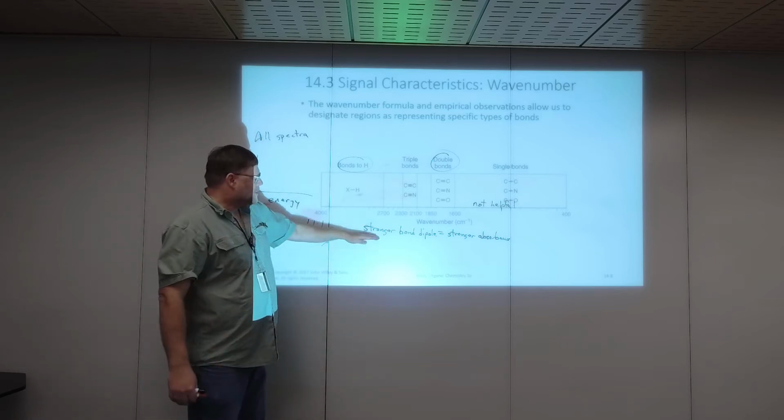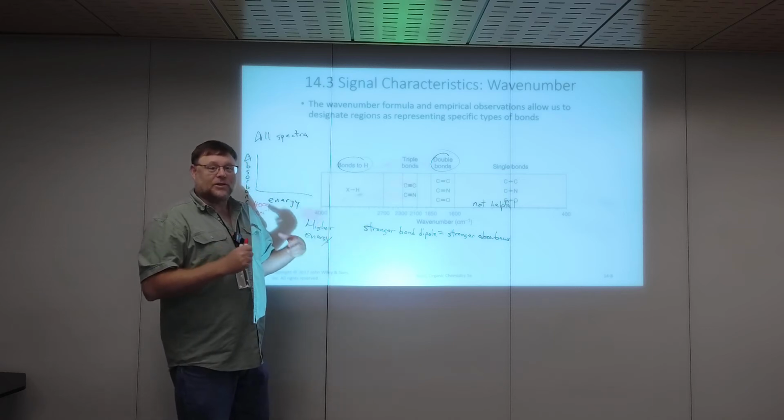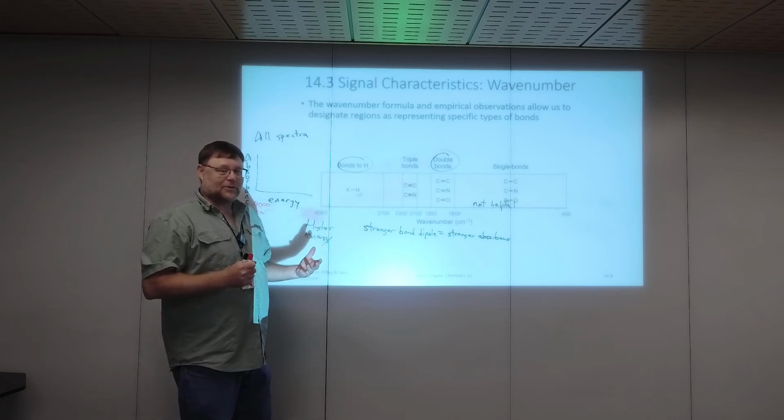All right, stronger bond dipoles. The bigger the dipole in a bond, the stronger the absorbance in the infrared spectrum.